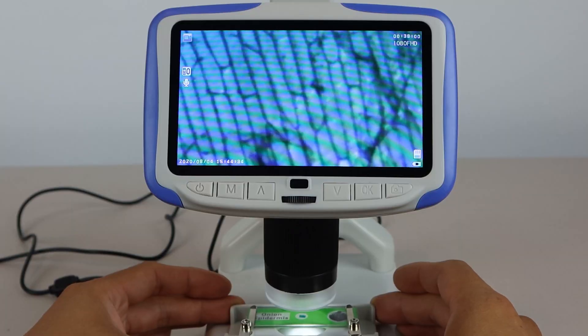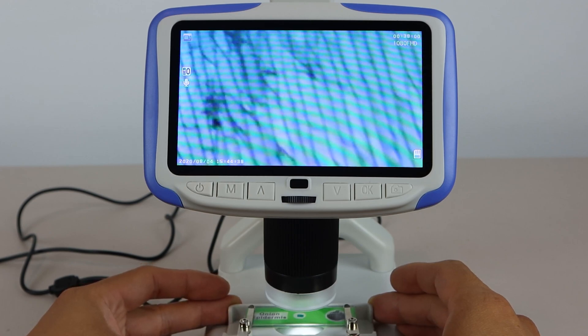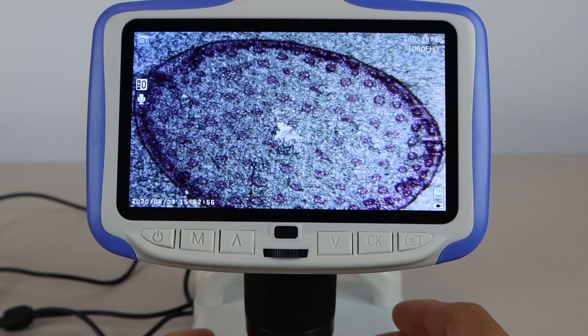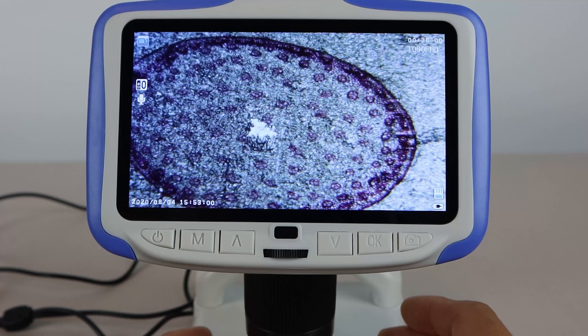Overall, this digital microscope works well and provides high definition video and photos from its lens at a decently high magnification at around 200x. The images and video are clear and the microscope is easy to use.